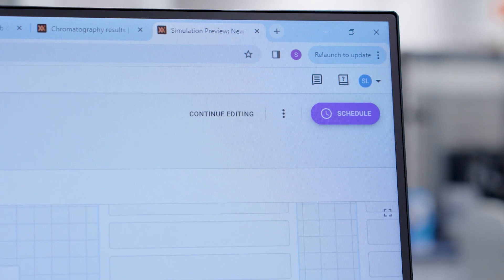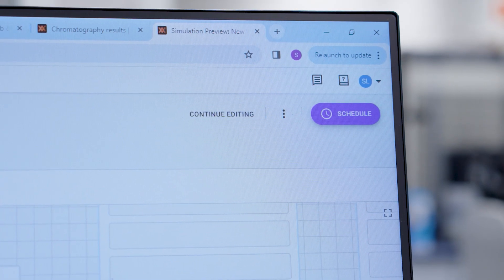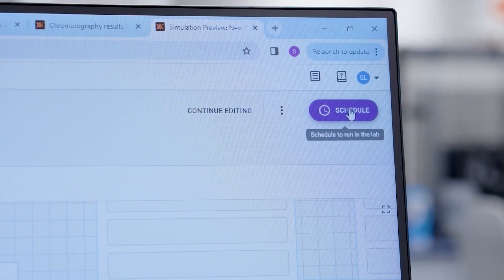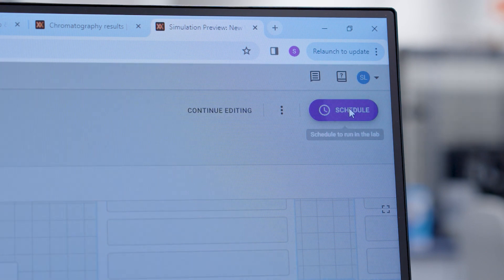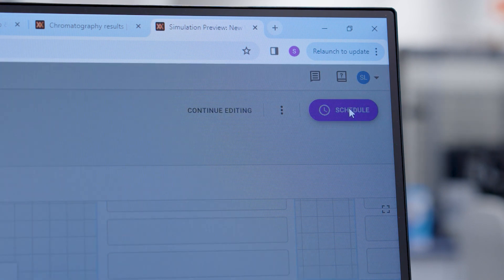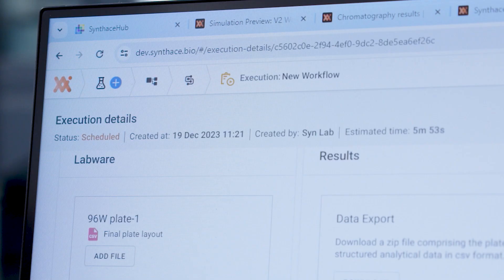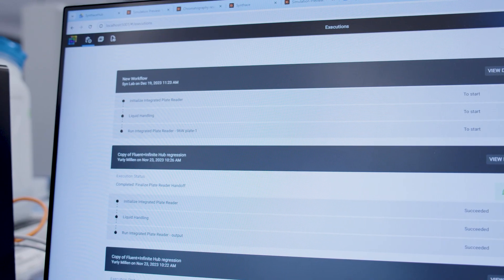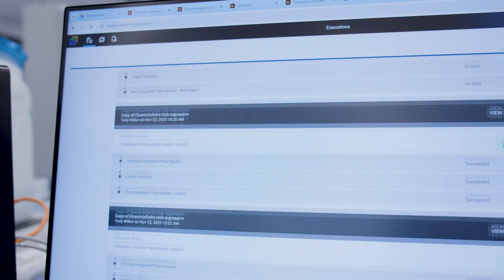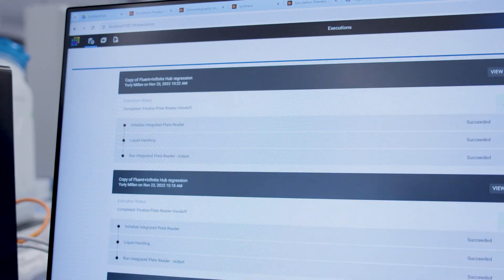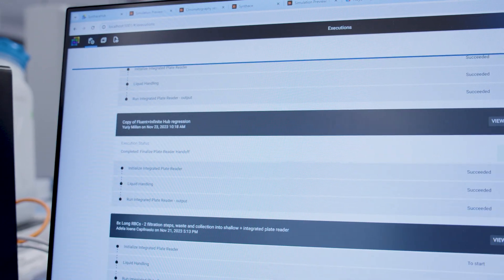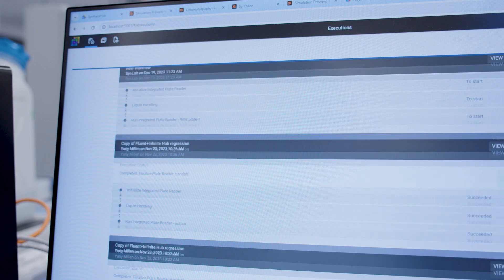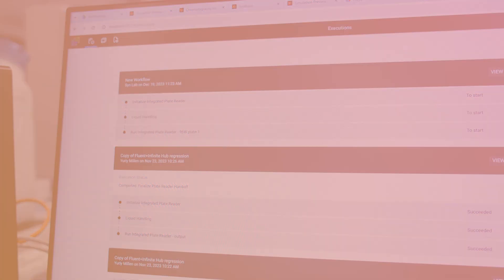So now we can send that information to the Fluent by clicking schedule. This will turn that simulation into an execution which will pop up on a local software called Synthase Hub which will be on the computer next to your Fluent.